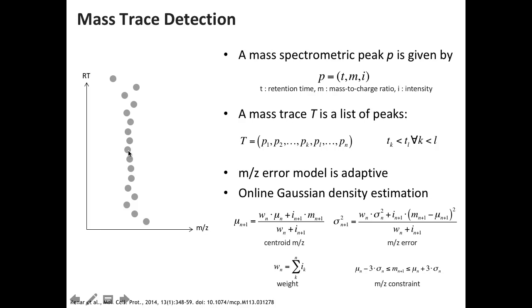What is perhaps not obvious when you look at the data for the first time is they have more or less the same mass to charge ratio here in the middle, and then they begin to scatter. Why is that? Sensitivity, the number of counts you can get. As you go down, it becomes harder to spot the peak, and it becomes harder to call the apex of the peak. So the mass accuracy of this mass trace goes down as you approach the noise threshold. And that is interesting because it tells us when we can stop collecting peaks.